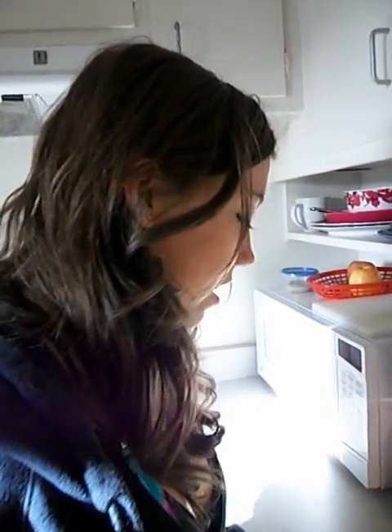Hi guys. I am going to do a dissection today.